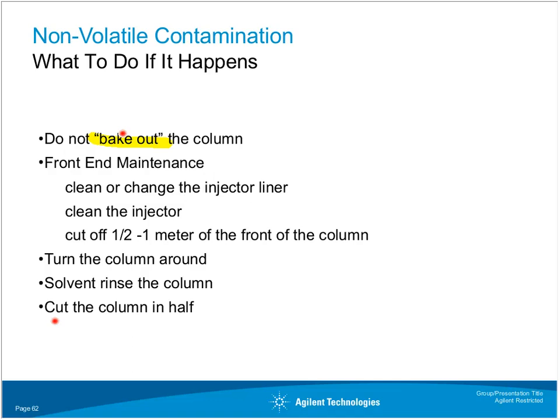With biological samples, I've seen more than one time where customers actually had to cut the column in half to regain chromatography. And don't be so concerned about this half meter to 1 meter thing either. Even when you cut the column in half, as long as you adjust for it, you're not going to lose half your resolution. It's a big misnomer out there.